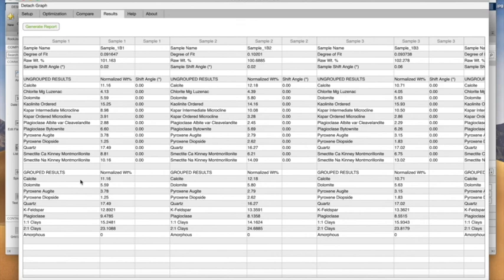If I said there's 8.98% of intermediate microcline in here, nobody would take that seriously because the technique is not good enough to tell it apart from other types of potassium feldspar or even plagioclase that well. But I can group them together and say there's about 13% potassium feldspar, about 9.5% plagioclase down here, and so on.